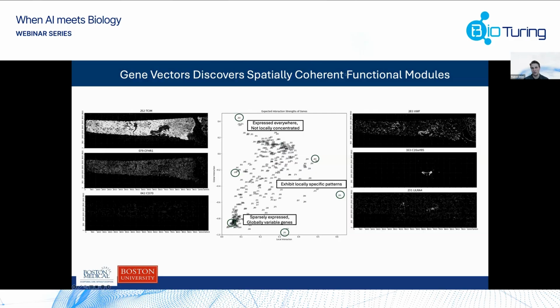Then it gets harder and harder. We have a student right now who is doing this, but in that approach, we subset individual cores and then do the alignment, which is a bit of a challenge. I think there are ways to improve this in the future, but we probably need to expand on different types of data alignment and registration that are not just affine based, but also allow you to morph some of the input data.